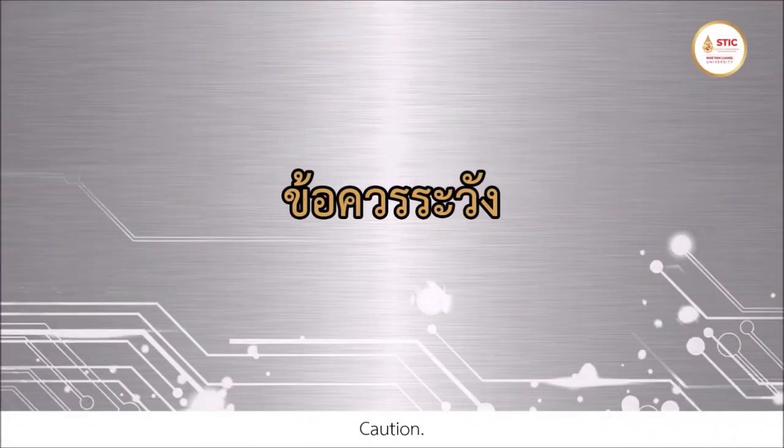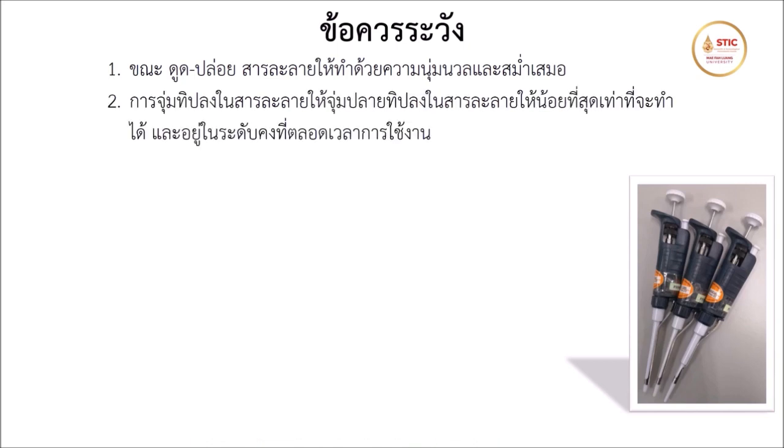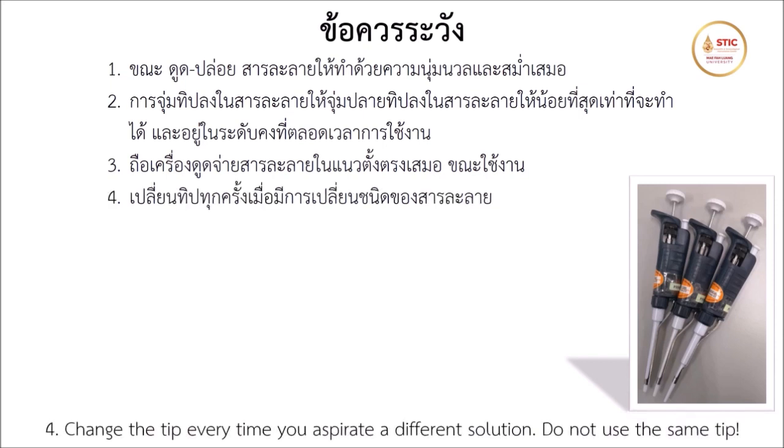Caution. Always aspirate solutions gently and constantly. Dip the tip into the surface of solution as shallowly as possible and maintain the same depth during the whole time you are drawing the fluid. Always hold the autopipette vertically. Change the tip every time you aspirate a different solution.